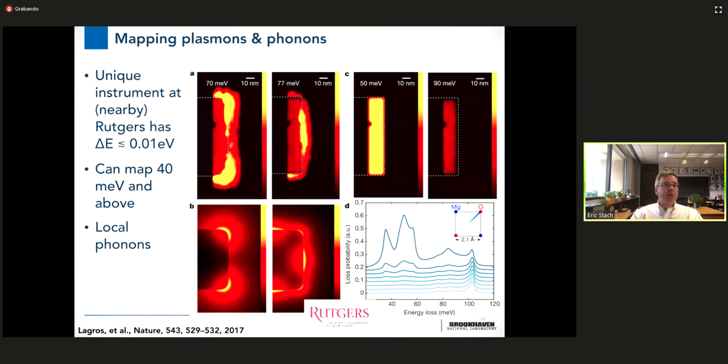Okay? So I would like to recognize a question, so thank you so much. There was a question, is it possible to look at frozen solution samples to probe large individual molecules? Yes, it is. So I will be honest and say that I'm preferentially giving a lecture on using the electron microscope for materials applications, and that's because I'm a material scientist and not a biologist. It's possible to give another 2-hour lecture on the use of electron microscopes for doing biology. I'm not capable of that lecture, just to be frank. I took biology in 10th grade, last time.